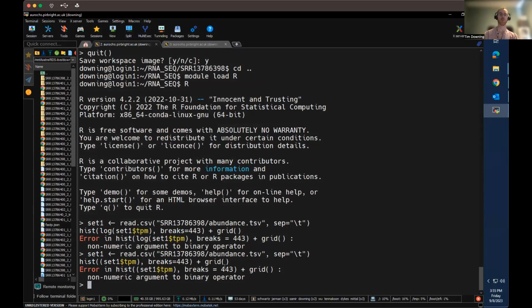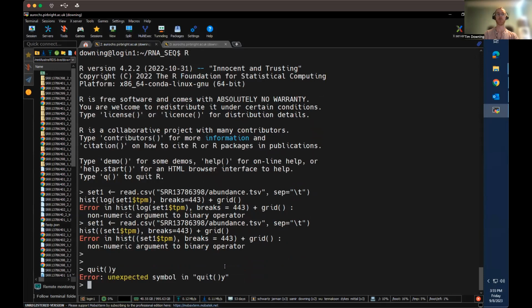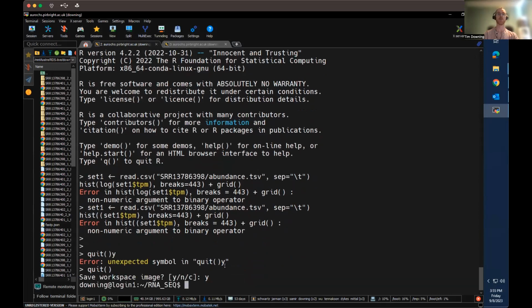So next, now that we've finished this, we can go on to using sleuth, which follows up in our next demonstration video. Remember to complete that for all the 10 libraries, the 5 samples in total that you're going to examine. And we'll move on to sleuth next.